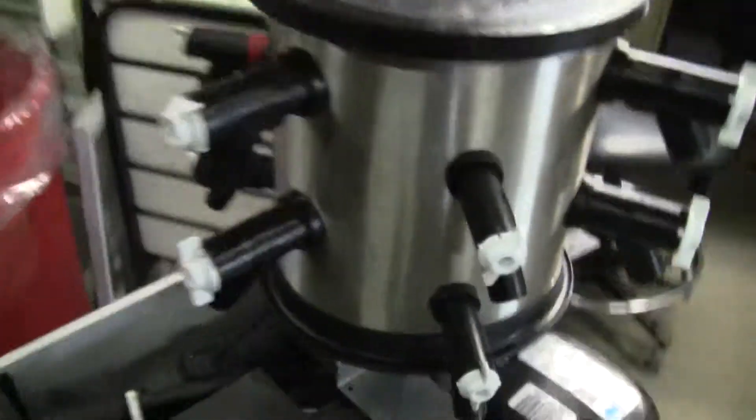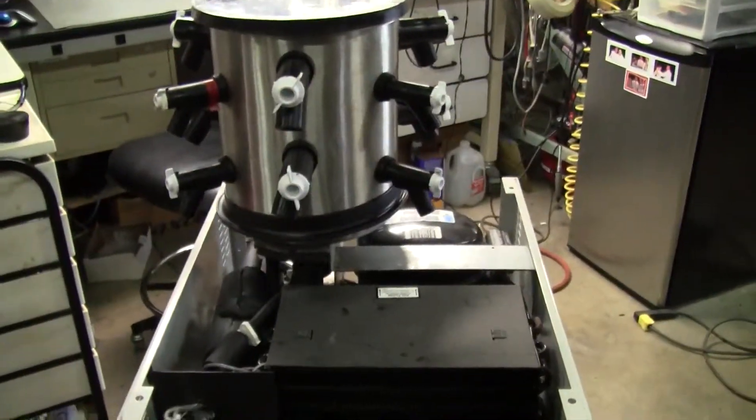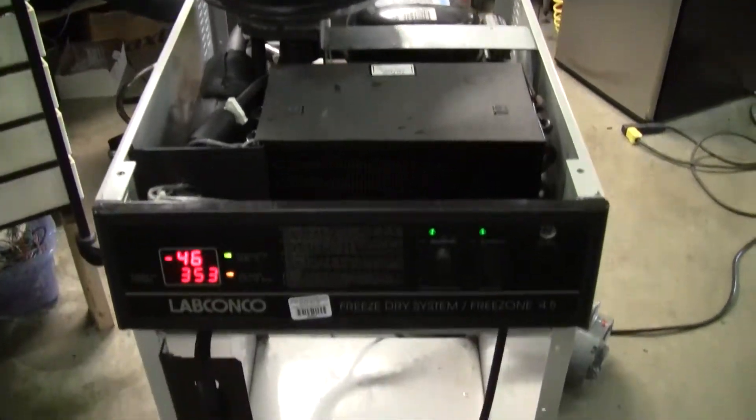We're going to put the unit back together. If you have any further questions, please don't hesitate to call 609-518-9100. Thank you from Hi-Tech Trader.